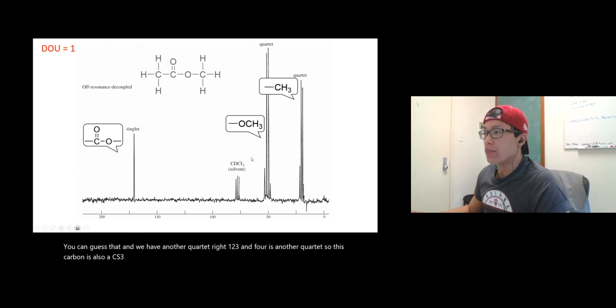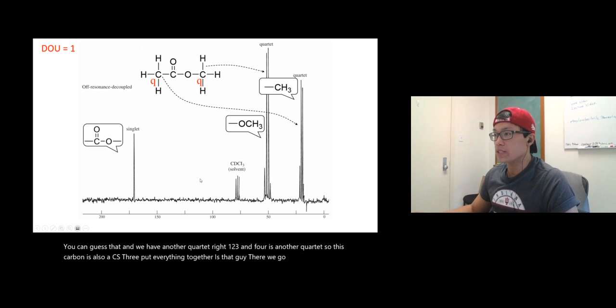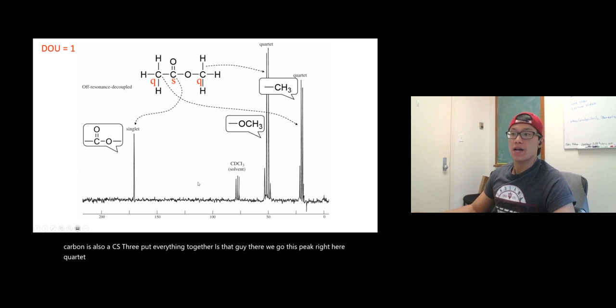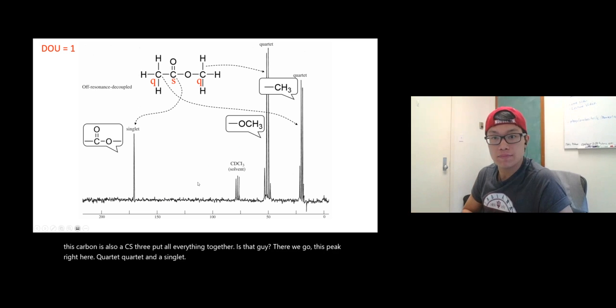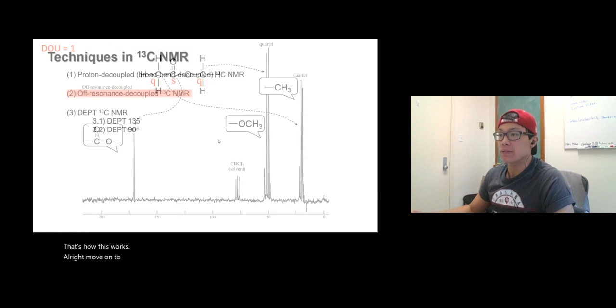Put everything together. It's that guy. There we go. This peak right here, quartet, and a singlet. You know that? Yeah, that's how this works. All right, move on to the next technique called DEPT.